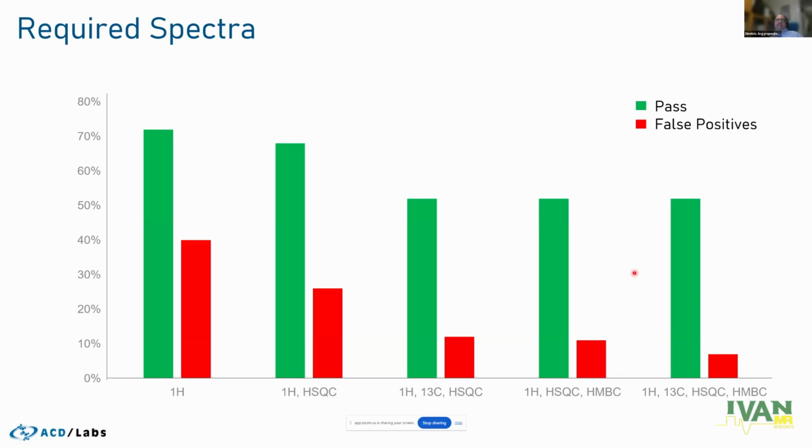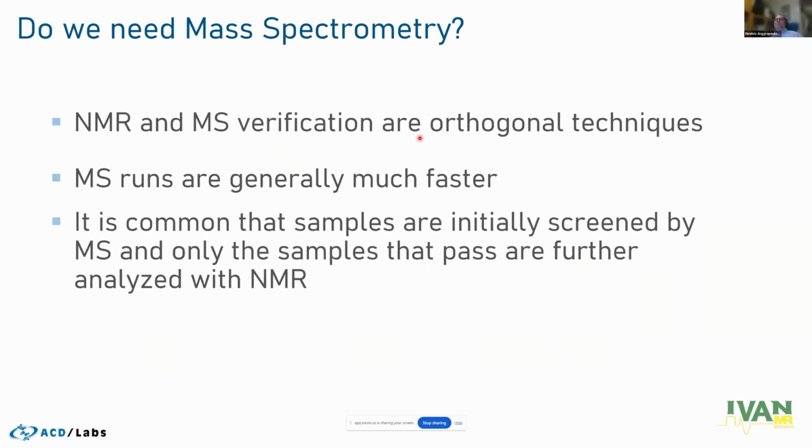I can tell an example here. We had a case where somebody was using an ASV system to check their raw materials. And they had this polysubstituted aromatic ring, which only had 1 proton. So if you recorded only a proton spectrum, in essence, any sample with a single peak would have verified against that structure. So you need carbon information. That's the bottom line.